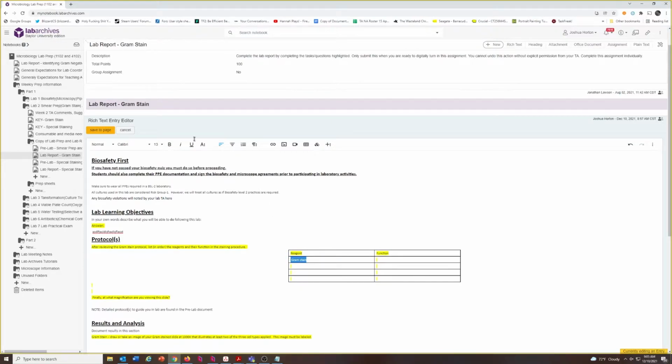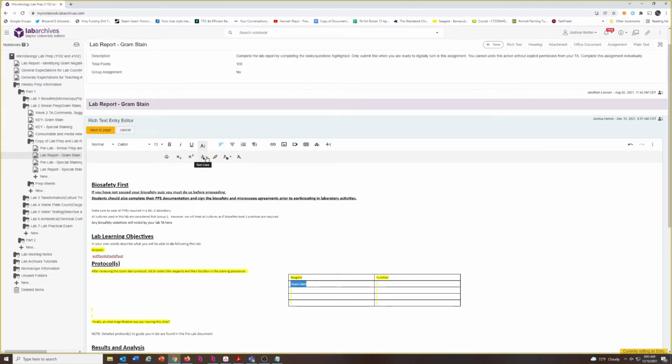If you highlight this, select more text, you can then change the background color to white, and now it is a clean and easy to read thing. If you personally want it to be a larger text, you can of course change the text as you want, but it's not necessary really to do. You don't want to fiddle around with this too much, but there you go.